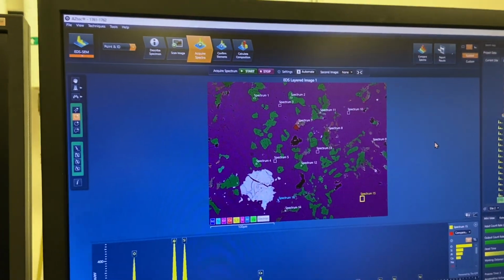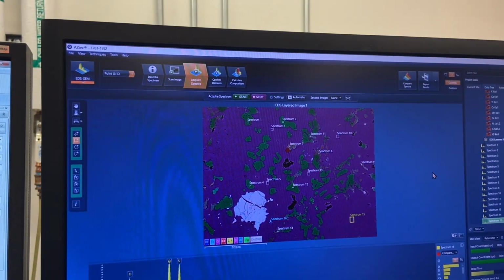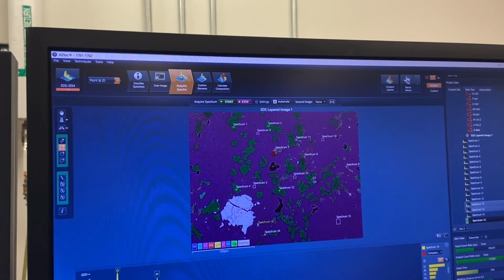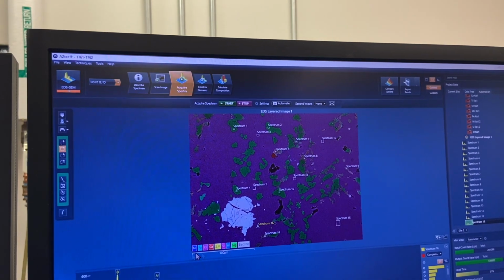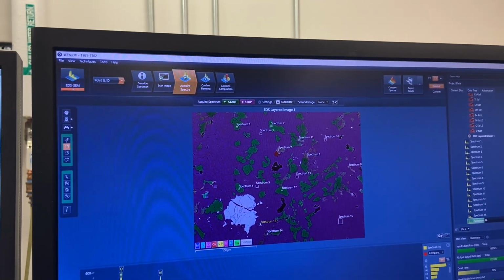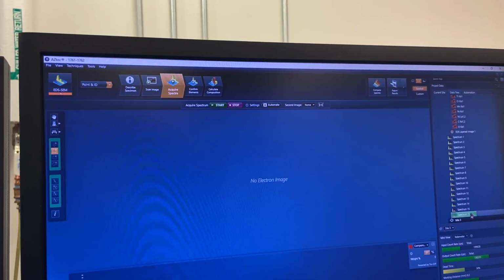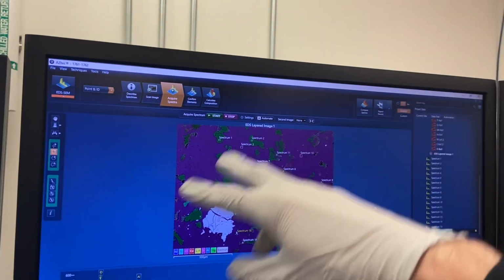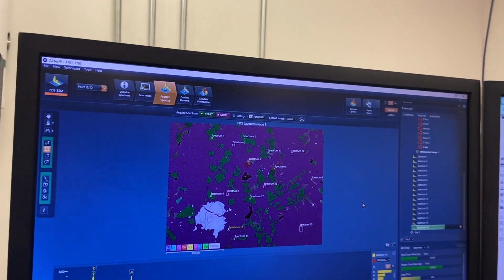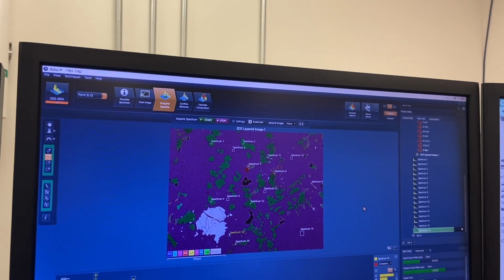You know, that's something I'd have to check, but yeah, so these are all the thoughts that go in my head when I see these samples. And yeah, obviously this is a very small area, so this won't tell me what this lunar meteorite is from this one thing. I have to go to other sites. You have to get a representative sampling of the sample. I can't just get 2 points and call it a lunar and that's it. That's not the right approach to classification. You need to go around the sample. You need to see what the classes are. Is there zonation? What's going on in this sample?